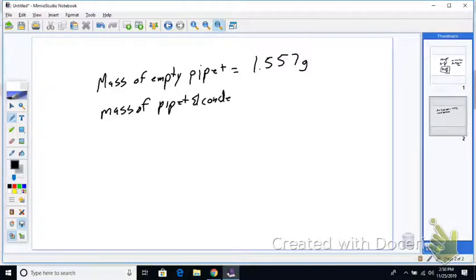So that's after you've heated it and let it cool to room water temperature. So that's after you put it in there, you heated it, you take it out, you put it at room temperature, and now it condenses back down into a smaller volume. Okay, that we can weigh out.